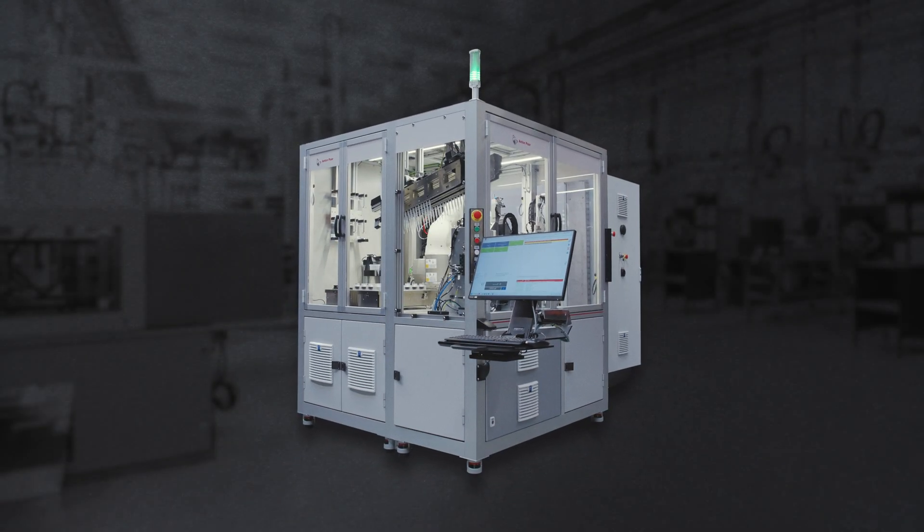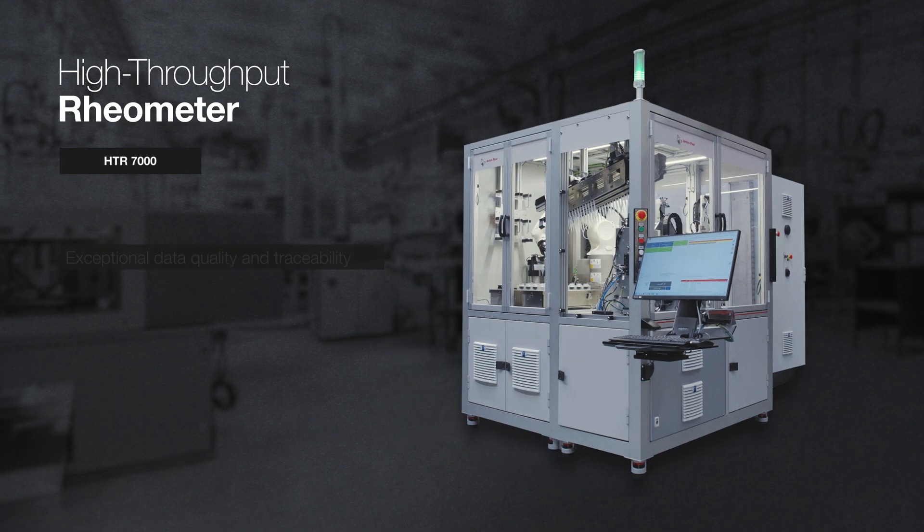HTR 7000, where precision meets performance.